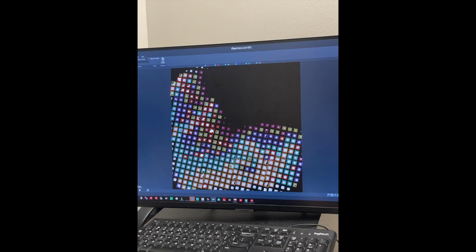So that's an image I'm showing here. This is looking at the entire grid, and you can see the whole circular shape of it. So this is not that high of magnification at all. But what you can see is that there's a lot of variability in these grid squares, where some of them have black spots just hanging out.